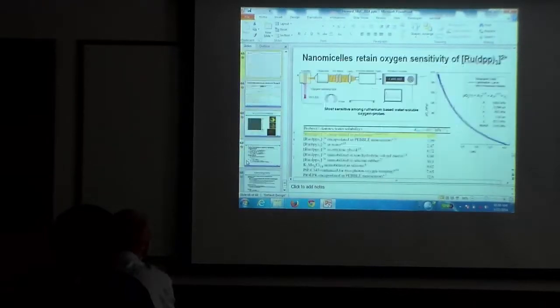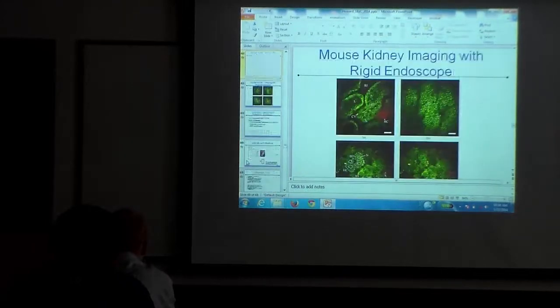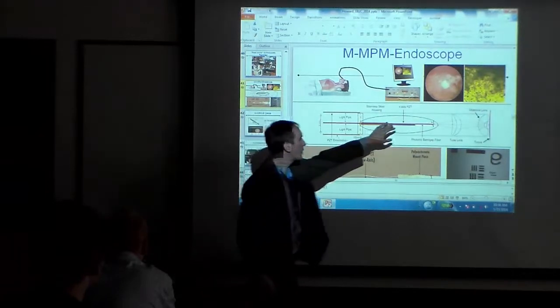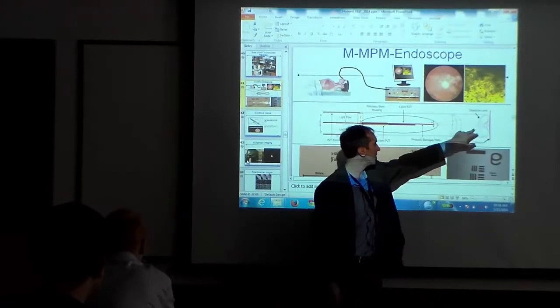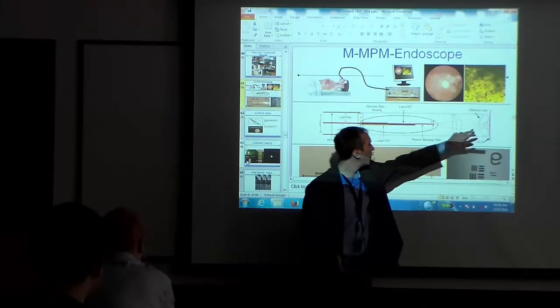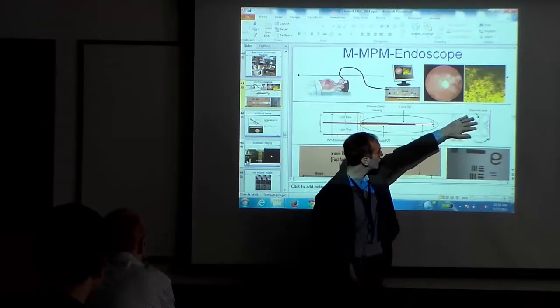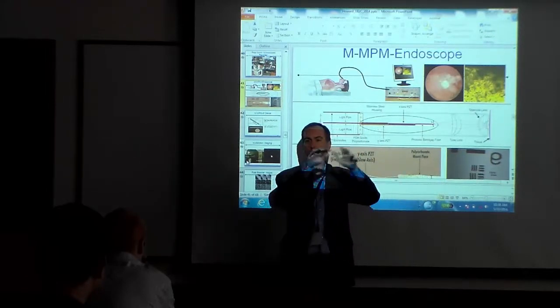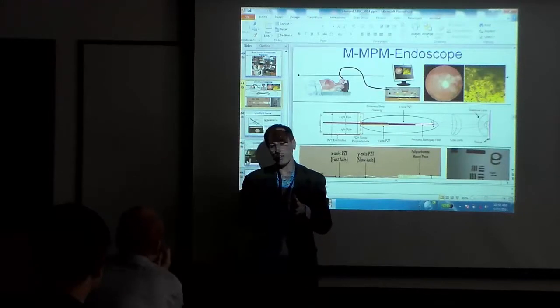So the original idea was, and actually we tried this, it took us a while to get working. I had a picture here. The problem is, if you're trying to focus down to this point, the focal length of these lenses for 1 micron can be very different than it is for 400 nanometers. What actually was happening is it's like a bifocal lens. We use the center part for the infrared light and the outer part for the visible light. And they're coated with different anti-reflection coatings in order to compensate back. That's what we proposed, and we eventually got there.